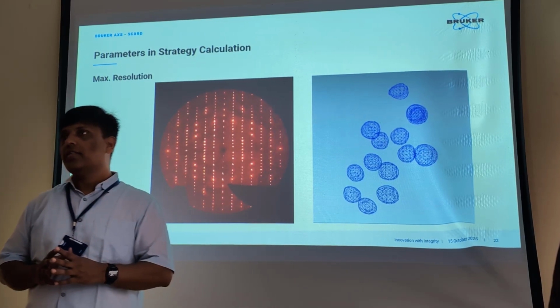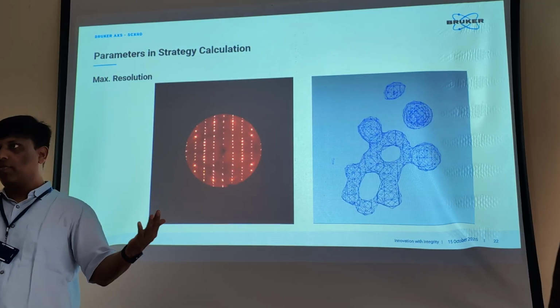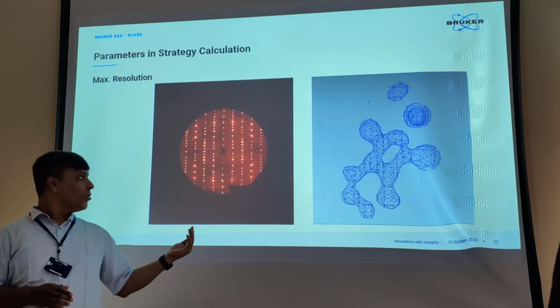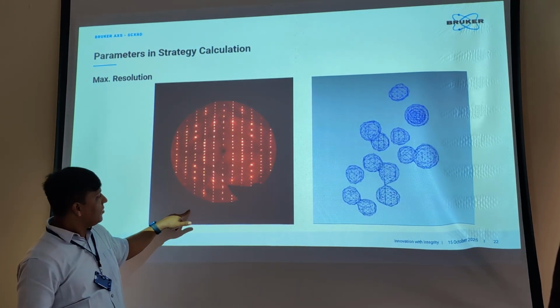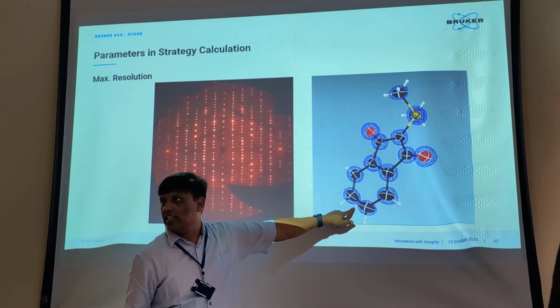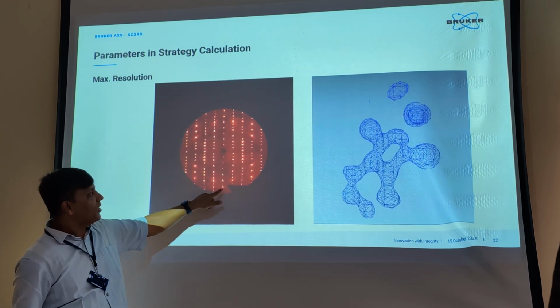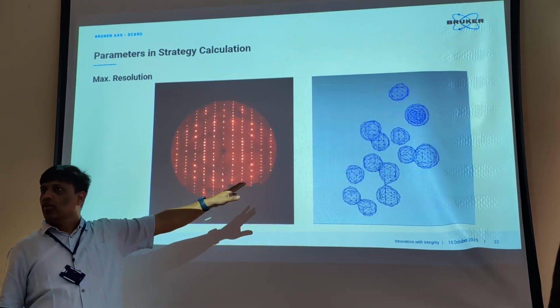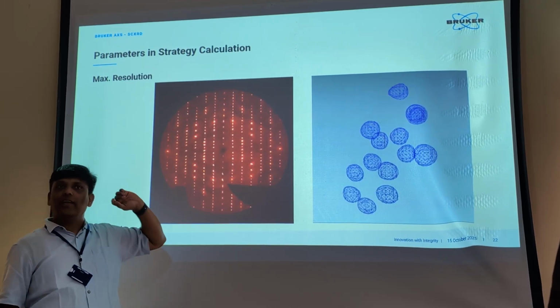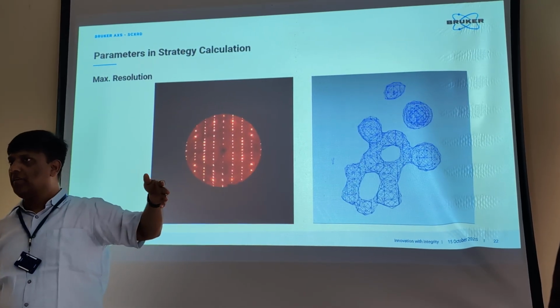Small molecular crystals are very good diffracting. So you can achieve a resolution up to 0.84. When you have a higher resolution, your atom positions get clear and then you can establish the structure like this. But if you just have poor resolution, you can see just a skeleton. So in protein, getting a resolution up to 1.4 angstrom is already difficult.